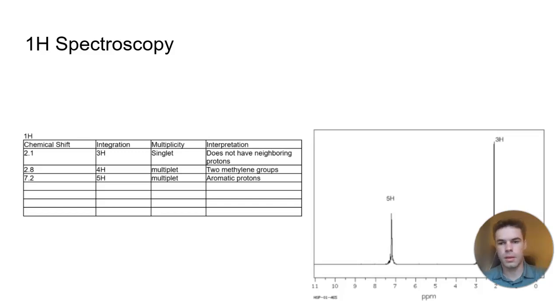And then next I have the hydrogen NMR spectroscopy analysis up, and I noticed that there is a chemical shift at about 2.1, and as the spectrum shows, it has a 3H integration, and I saw that I had a singlet multiplicity, so that is an indication of there being no chemically unequivalent neighboring protons that would cause a greater multiplicity.